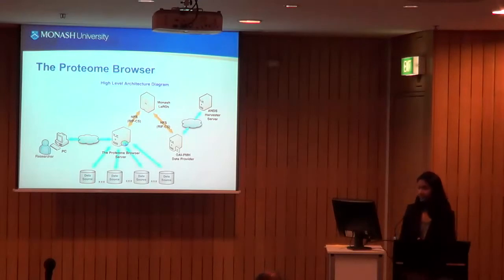At the moment, the web interface, I think, is the ideal interface for researchers because it allows them to see it on a single web page. You can actually get a holistic view of all the proteomics data that's available for a chromosome or a specific gene set.